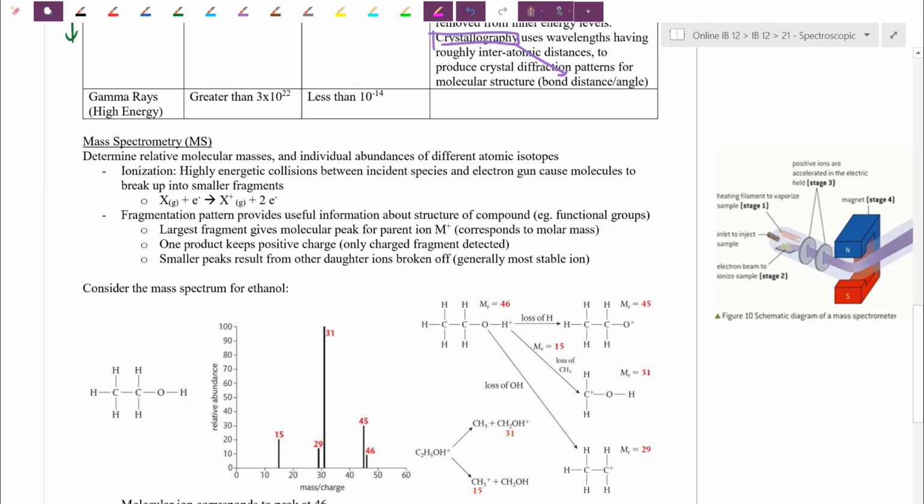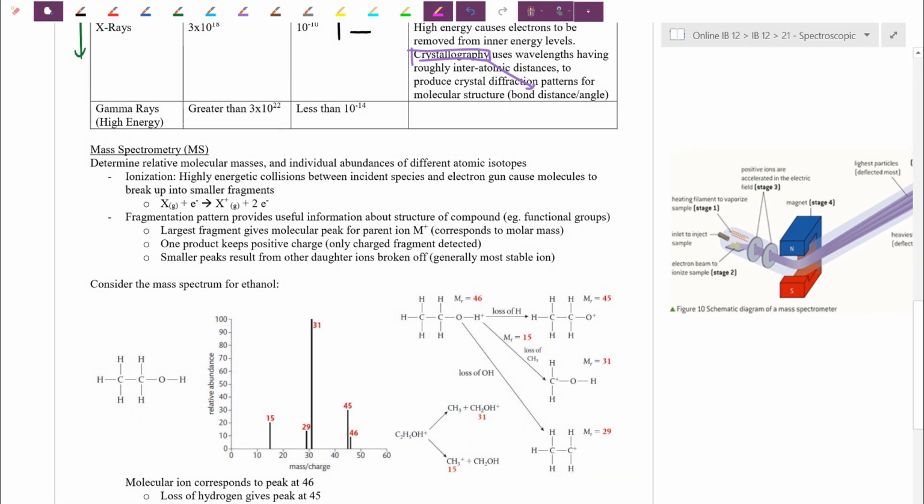Okay, so for the rest of this lesson, I want to emphasize the first main technique. So we had the index of hydrogen deficiency. We already knew, do I have the equivalent of a double bond or the equivalent of a ring? The second technique here is the mass spectrometer. In the new revised curriculum, they say you don't need to know all the steps of mass spectrometry, but they are going to go through it in a little bit more detail anyway, so I may as well just go over it with you.